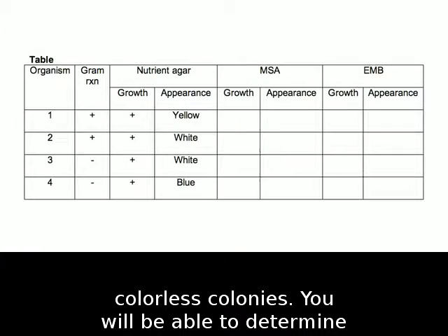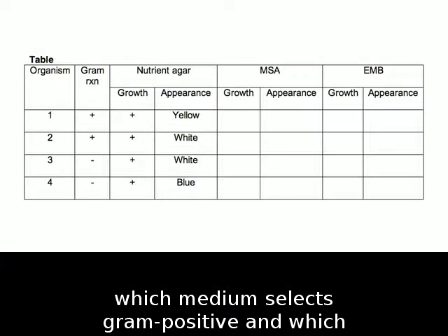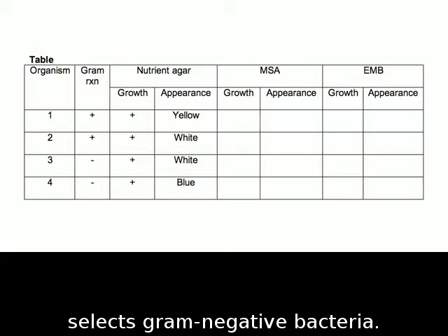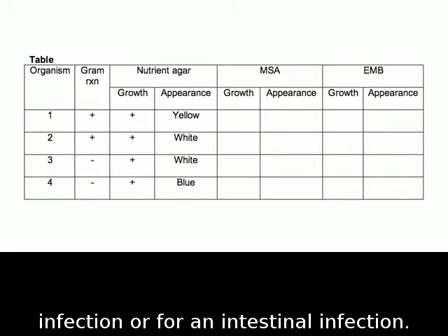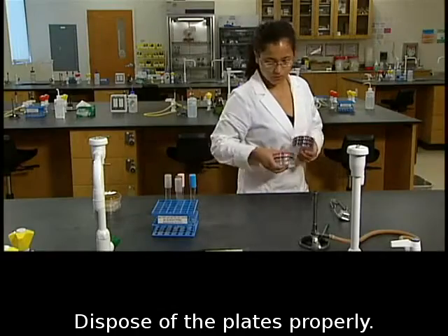You will be able to determine which medium selects gram-positive and which selects gram-negative bacteria. Thus, you will learn which medium to use for a skin infection or for an intestinal infection. Dispose of the plates properly.